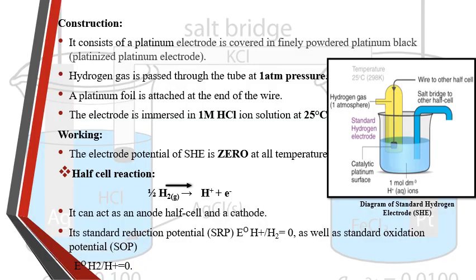The standard hydrogen electrode SHE is the reference electrode used in electrochemical measurement to provide a stable and reproducible reference potential. Its construction involves several key components and steps to ensure its accuracy and reliability. Now, here is a detailed description of its components. We have the platinum electrode. It is made of a platinum wire or foil, used as the base electrode.